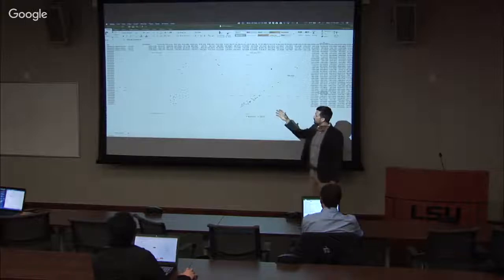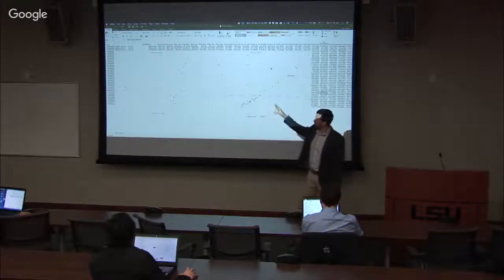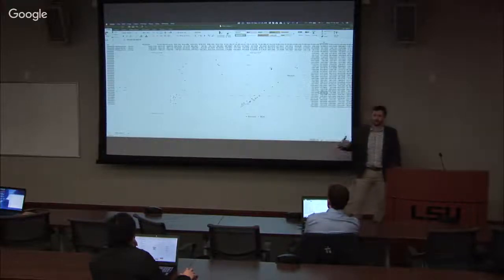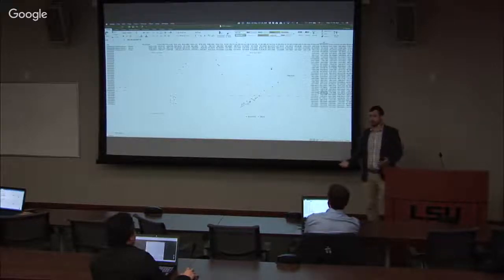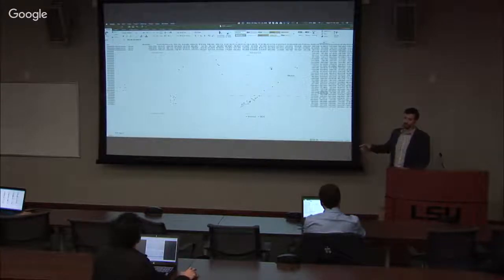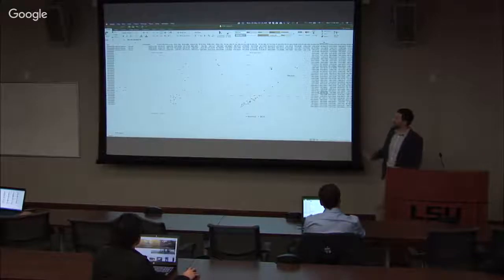But now that you transformed it, you would naturally go to that kind of difference, which is the more correct way, right? So what I'm trying to demonstrate is that you're typically not starting out already knowing what you're looking for. You just do sequencing and say, okay, let me now mine my data and see what's in it. And you could be confused if you don't have your data prepared for your analysis, and go in a completely wrong direction.